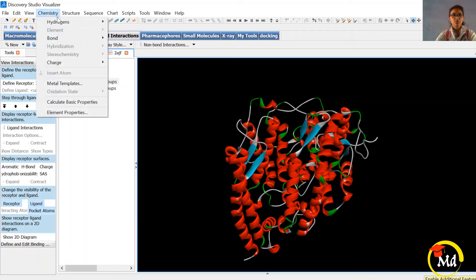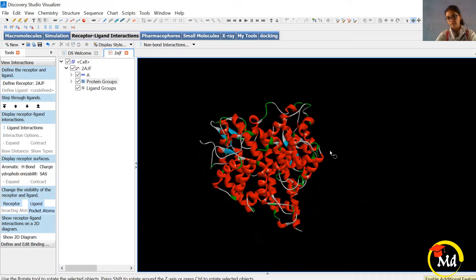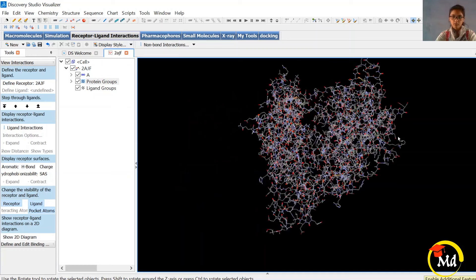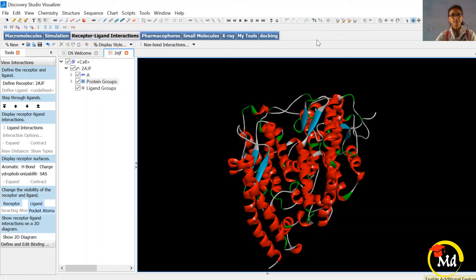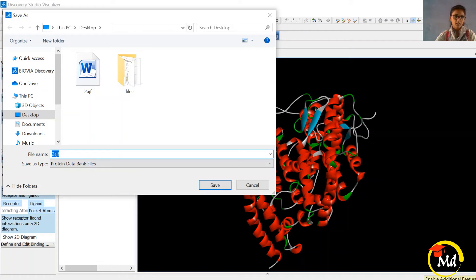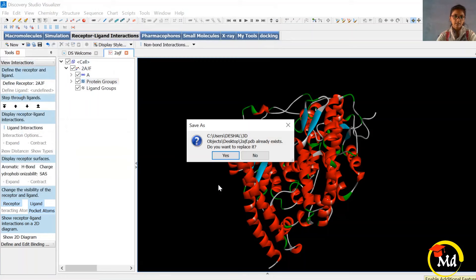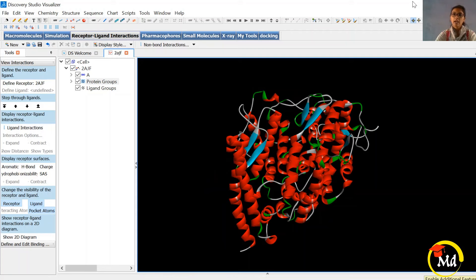Now we have only chain A with the protein group and ligand group. After this, we need to add polar hydrogen atoms. Click on Chemistry, then Hydrogen, then Add Polar. Polar hydrogen atoms have been added — you can check from the display style. Now we need to save this file in PDB format. Click on Save, and save it as 2AJF in PDB format — that is 2AJF.PDB. When asked if you want to replace the existing file, click Yes. Our protein preparation is now complete.